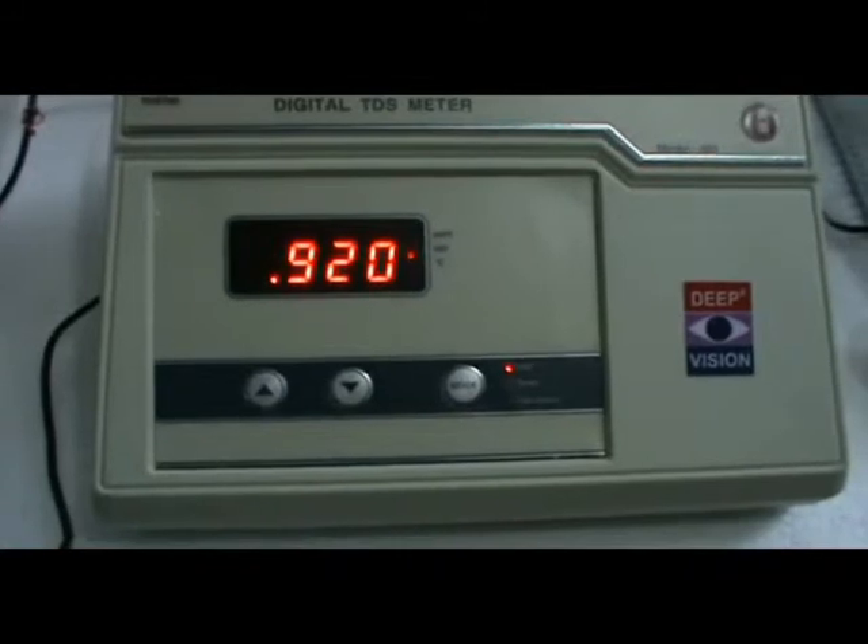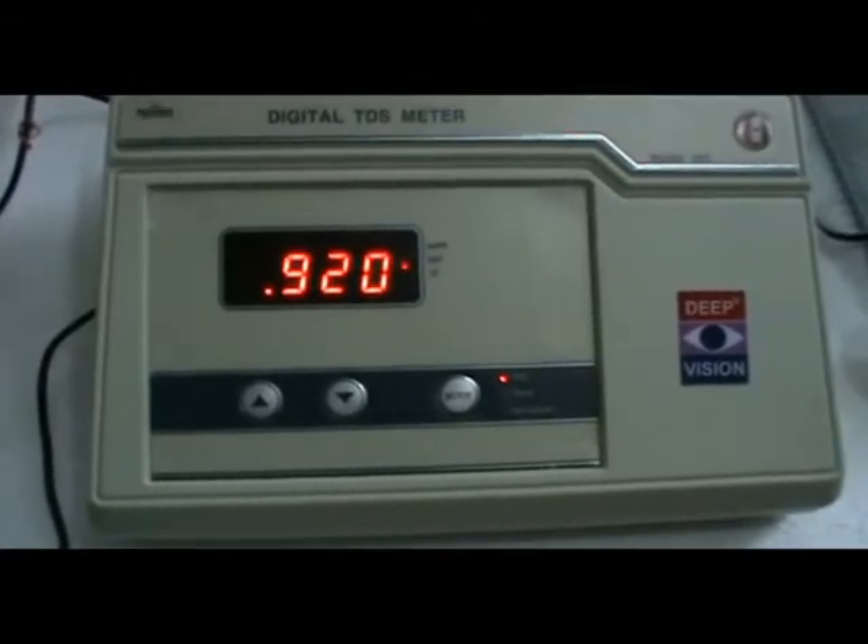Now you can place your sample and take the reading. The instrument is calibrated and ready.